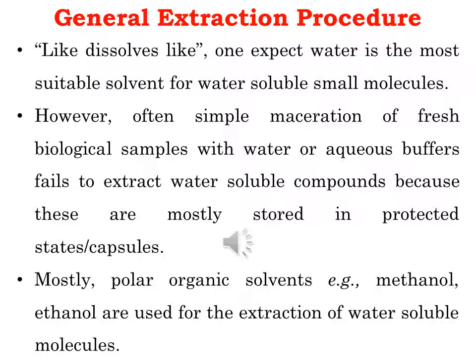Other methods to break up the compartmentalizations are sonication, freezing, thawing, freeze drying, heating, and enzyme digestion. These methods can be used singularly or in a combination fashion. Use of organic solvents also prevents microbial growth. That is one of the most serious problems associated with the isolation of organic water-soluble compounds.